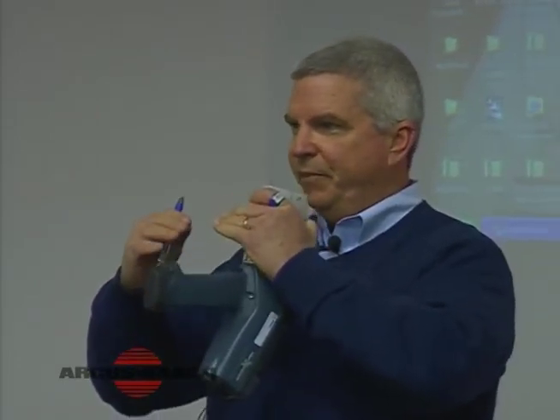If the beta peak starts getting higher than the alpha peak, the lead's more and more buried. It doesn't count layers of paint, it doesn't know that, but you can make an educated guess that your lead is coming from down under quite a few layers of paint if the beta peak's higher. Now why does that occur? Well, the alpha peak is at 10.5 keV of energy. The beta peak is 12.6.